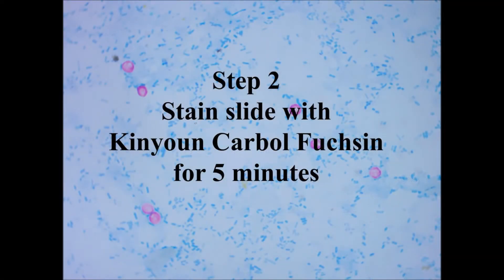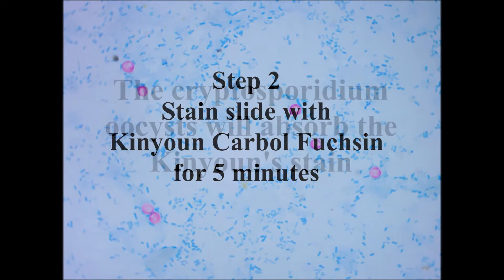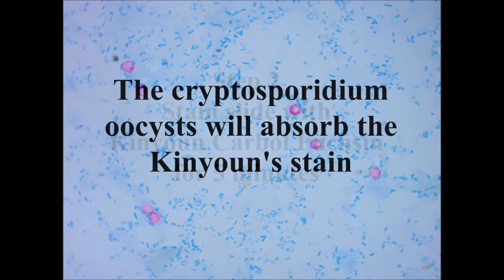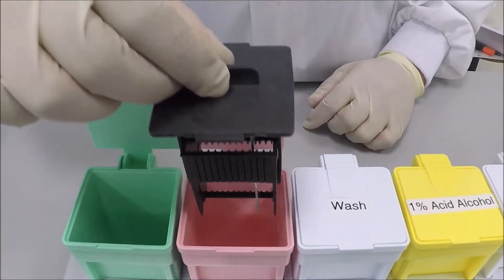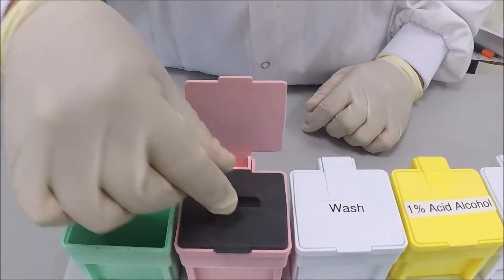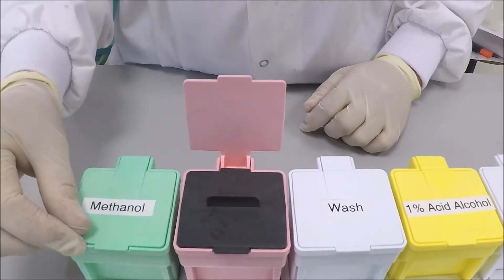Step 2: stain your slide with Kinyoun carbofuchsin for 5 minutes. The cryptosporidium oocyst will absorb the Kinyoun stain and turn a pink-purple colour.